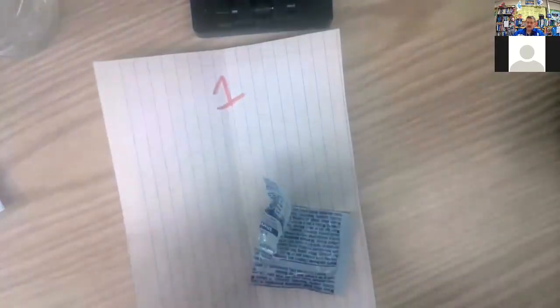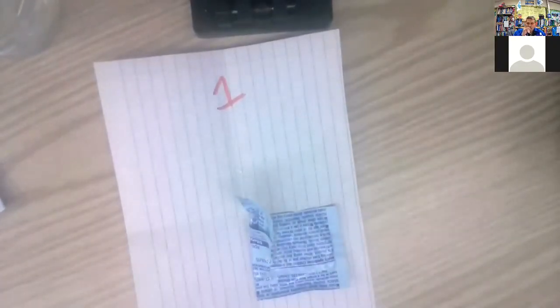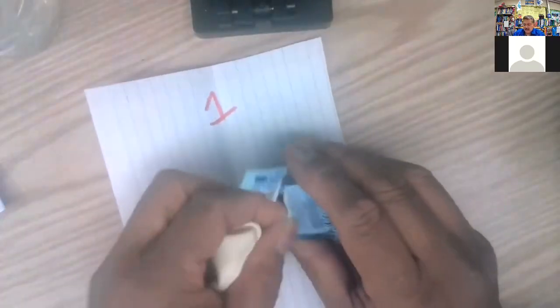Let me try the 1 first. So here's the 1. Stretch that out a little bit. Let's see. Start it. It is a balloon. And so I'm going to take the powder and pour that in successfully. If I miss, it will go on the paper, and I'll pour the rest off of the paper. So let's try.